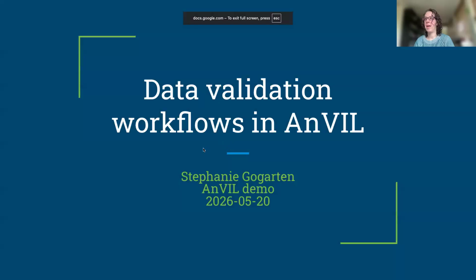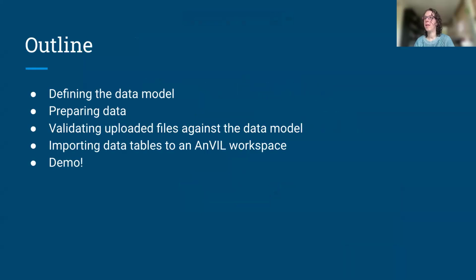So I'm going to go through some slides first, and then I'll give a demonstration of how the data validation workflows work. So I'm going to talk about how to define the data model, how uploaders prepare data to conform to the data model, how to validate those files against the data model, and then how to import them into an AnVIL workspace, and then we'll conclude with a demo.